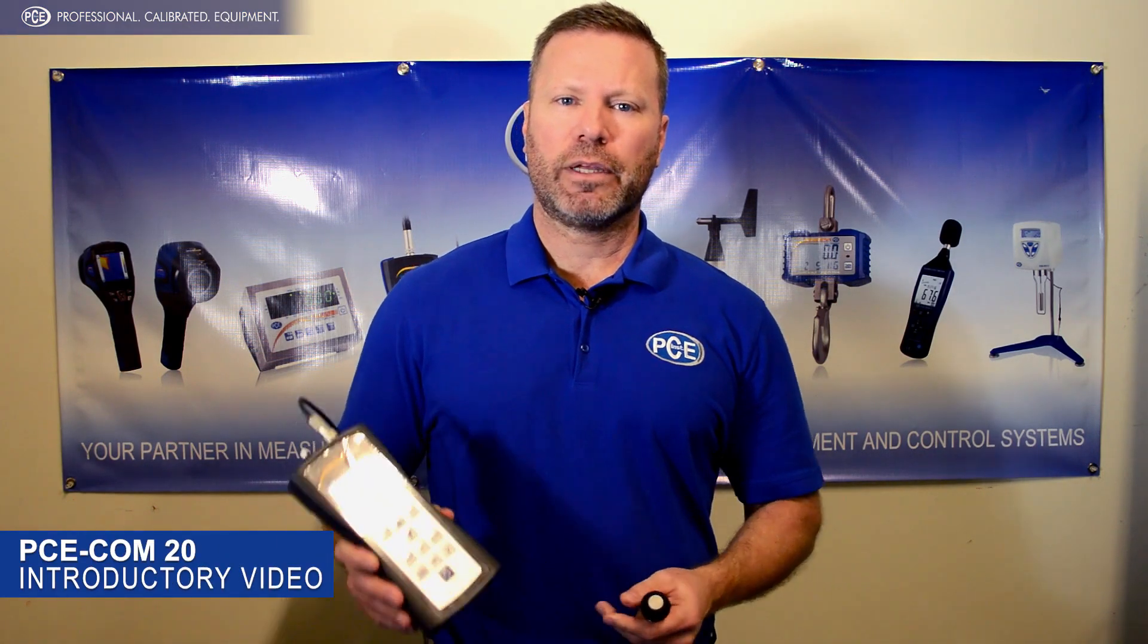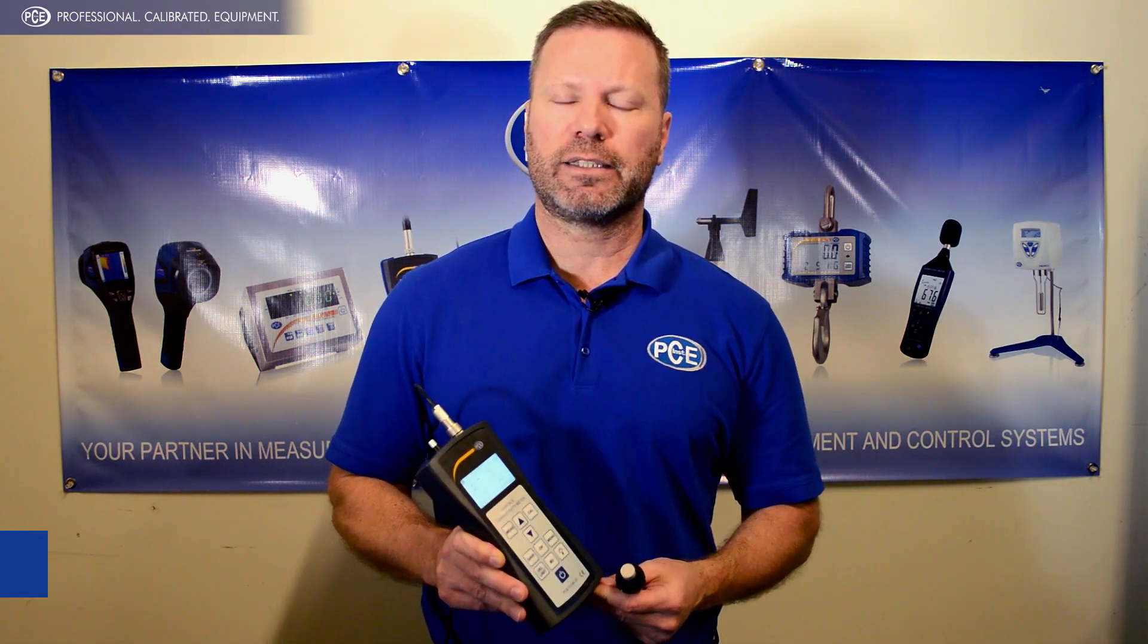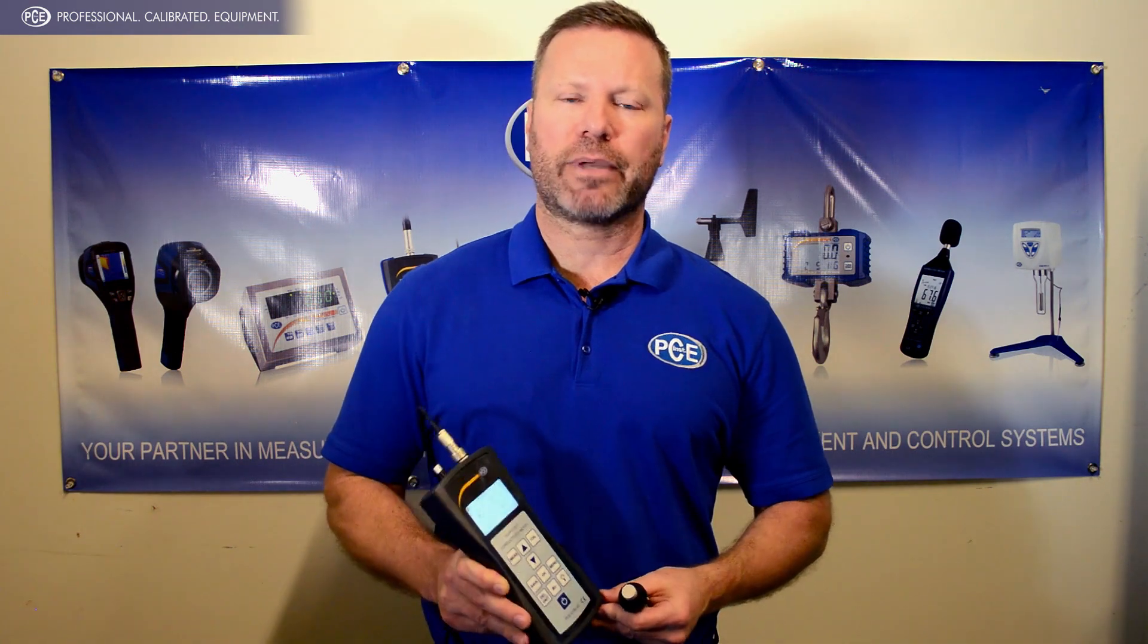Hi there, I'm Andy with PCE and today we're going to be looking at the COM20. This is a conductivity tester which will give you the conductivity of non-ferrous metals. Today we're going to be doing an application video so we're going to see how easy it is to use the meter.